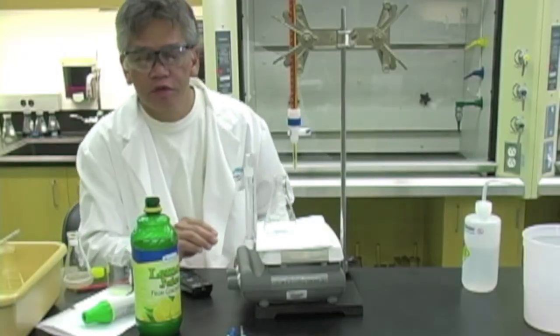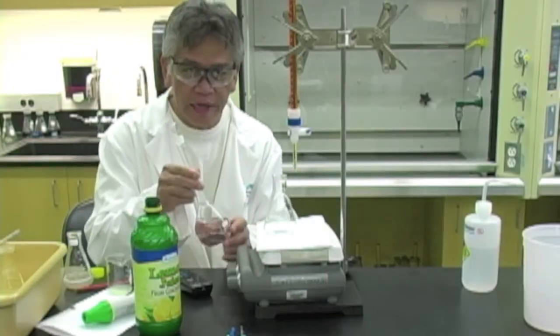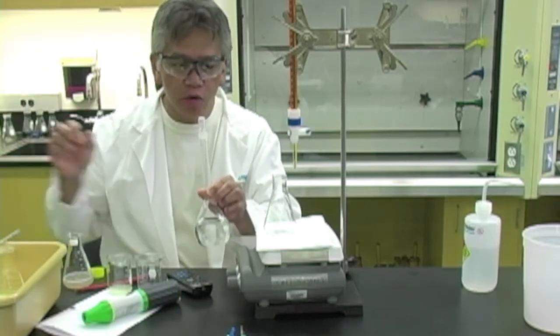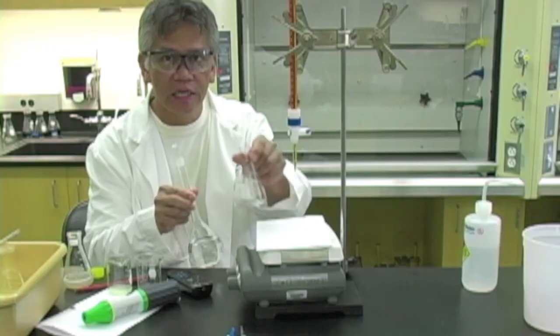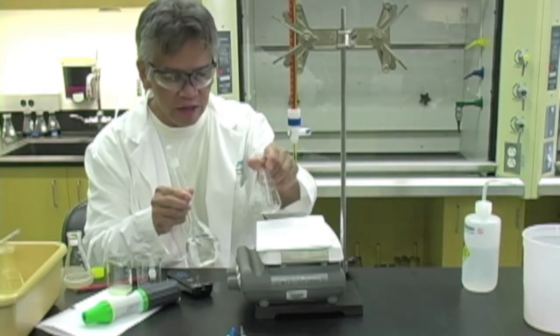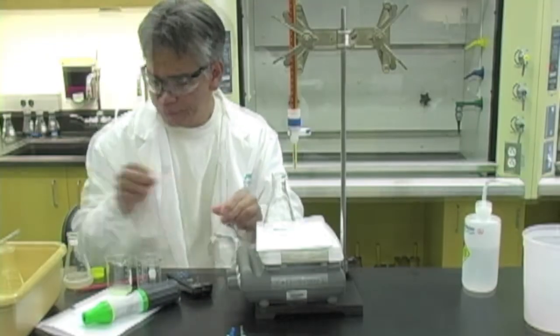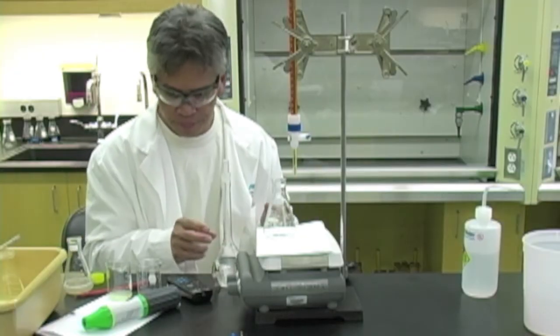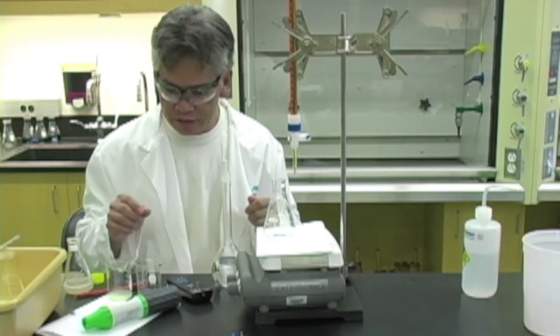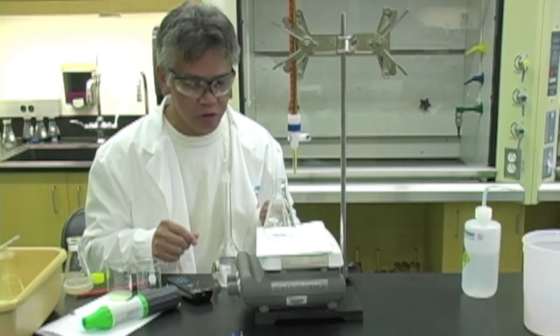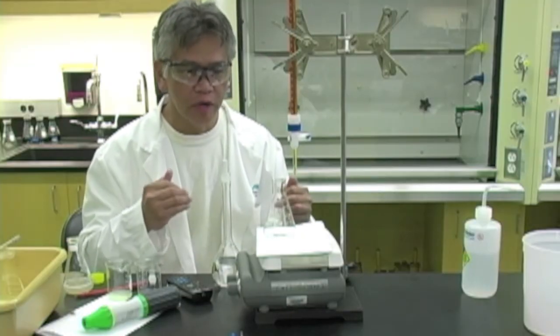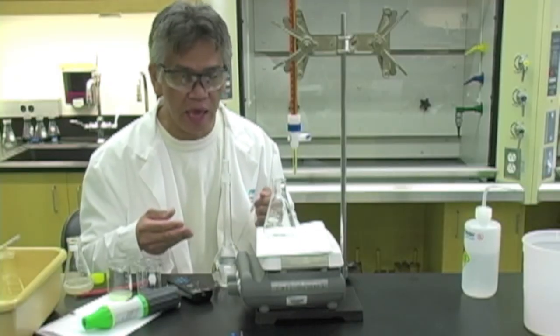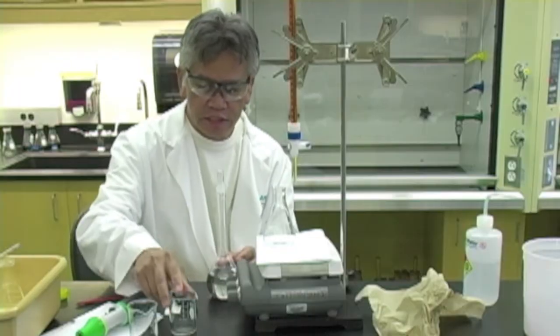So next I'm going to analyze my unknown. I'm going to do that by taking a 20 ml aliquot, placing it in this Erlenmeyer flask, adding starch solution, and then titrating it to the endpoint. For this particular sample, I'm going to again do a pre-trial titration to see what the endpoint looks like.